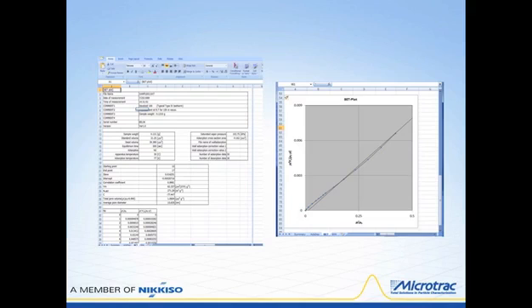And then one can go over here to the end point, and then by selecting this value here, in this case this is point number 14, the 14th point in this whole array of values. The whole concept here is to find a point where the correlation coefficient is very, very high. In this case, it's 0.9997, and it means that the linearization, or regression analysis, is providing us with an extremely high identity and correctness.